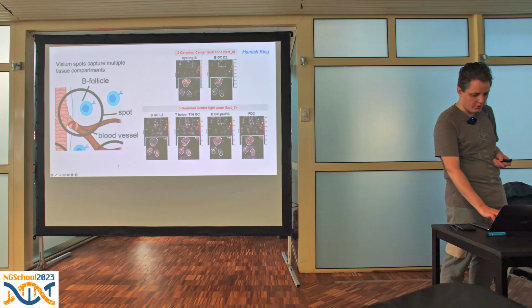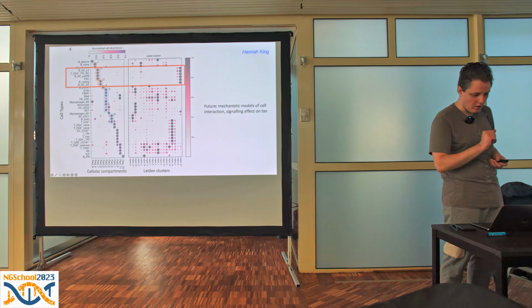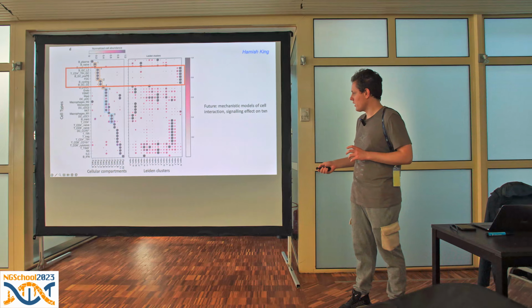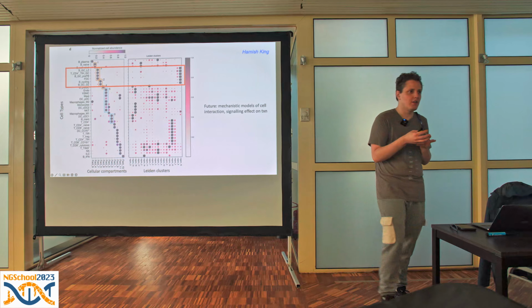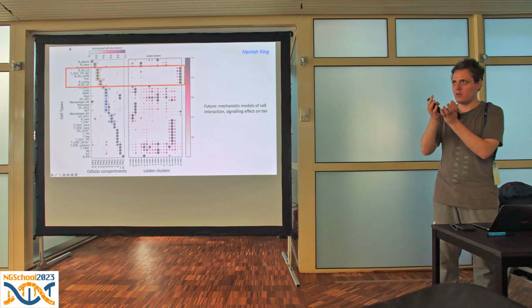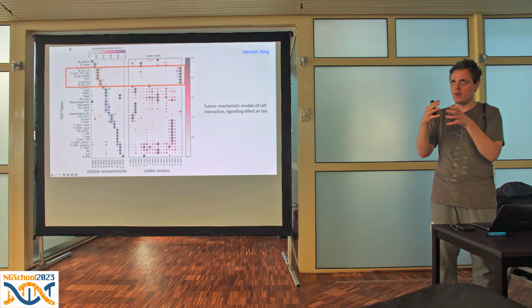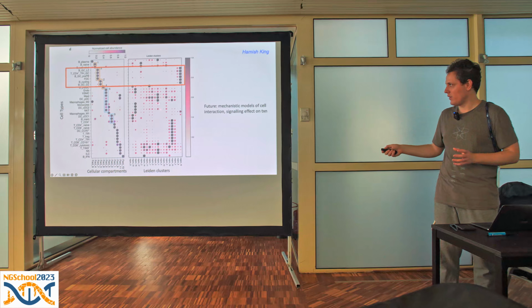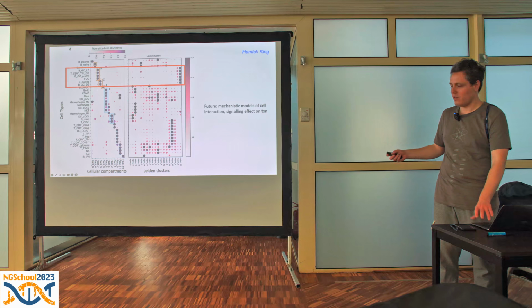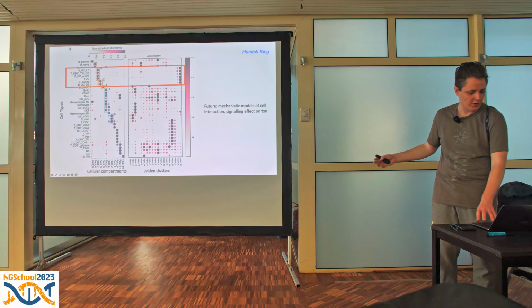And this approach works better than doing Leiden clustering precisely because of those overlapping compartments. If we tried Leiden clustering of locations based on cell abundance, we varied resolutions, but we could never separate these distinct known zones of the germinal center. And in these zones, B cells that are going through the process of their development necessary for their antigen response are doing different things depending on the cell type they interact with. So it's quite an important thing to recover, and you have to recover that using factorization approaches, not clustering.